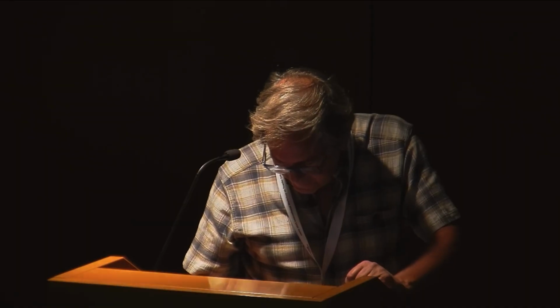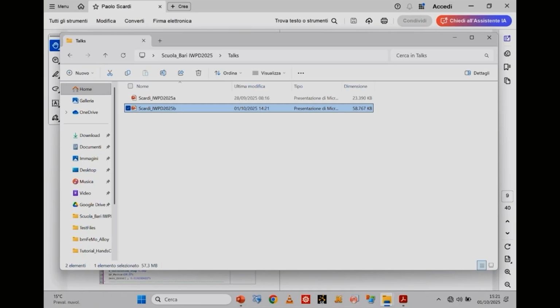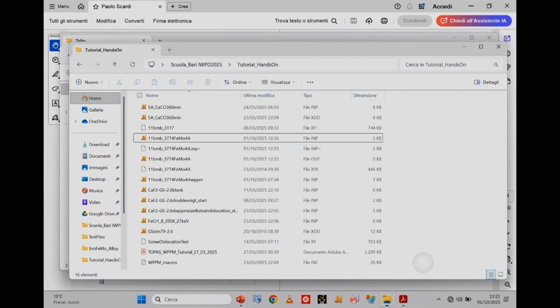And these are the files, by the way. No, these are not the files. Yeah, these are the files in the tutorial you find. During this 1 hour or so, we will go over one or two of them, okay? But then you can see the others on your own.